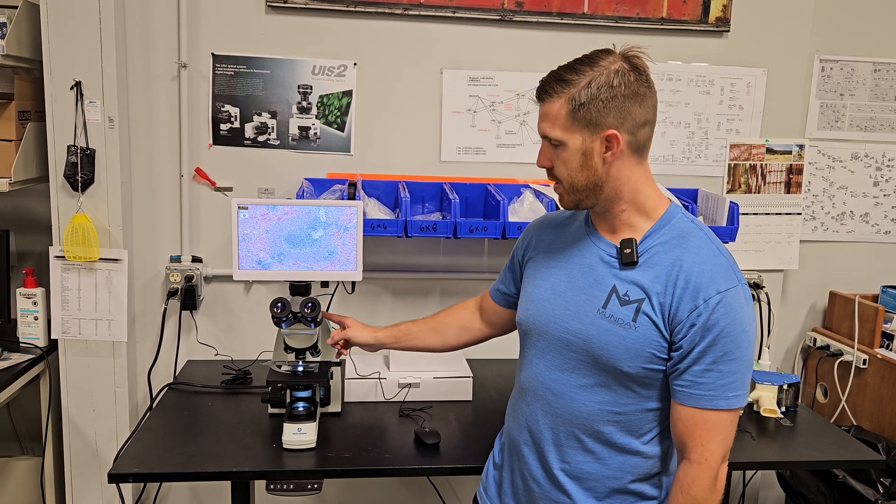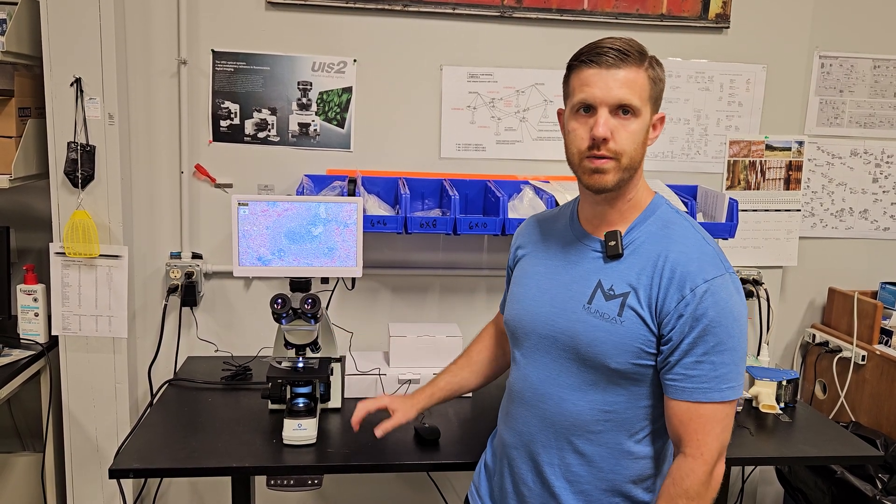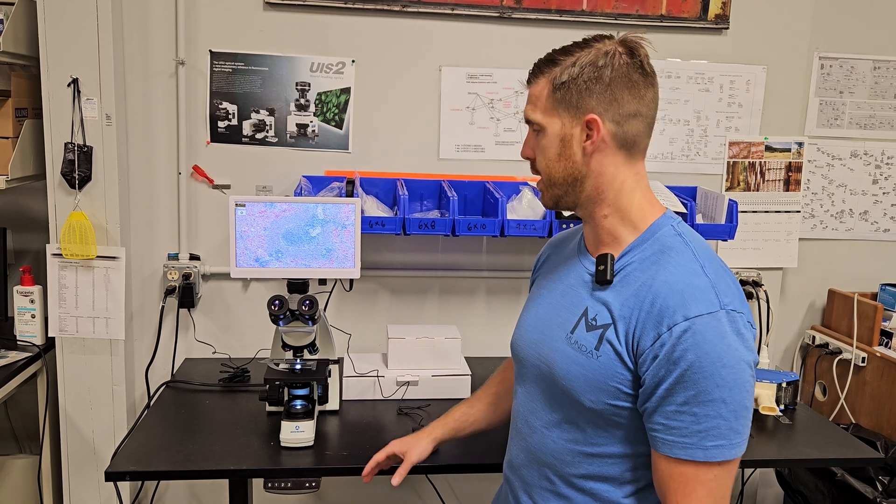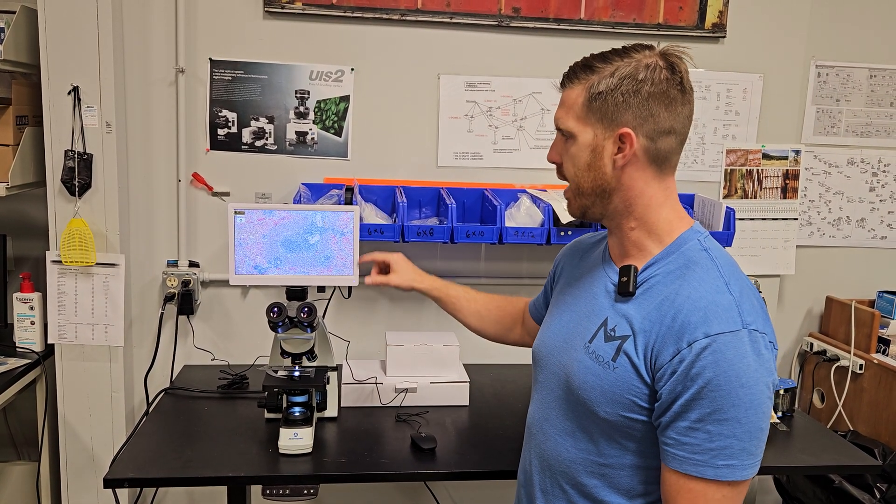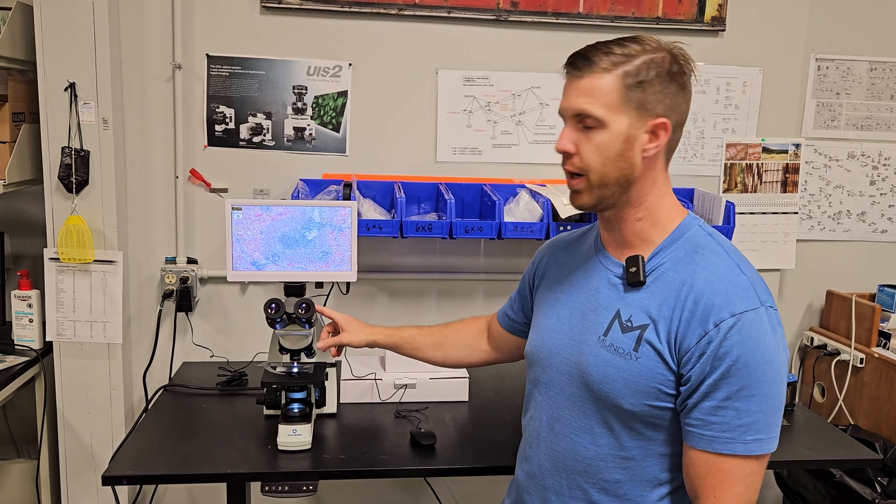We have added it to the AccuScope 3000 today just for the demonstration process. This is great. You're going to see this in a lot of vet clinics. It's really nice to have this screen added to your microscope.